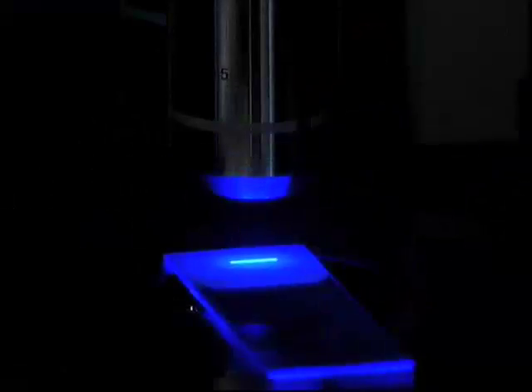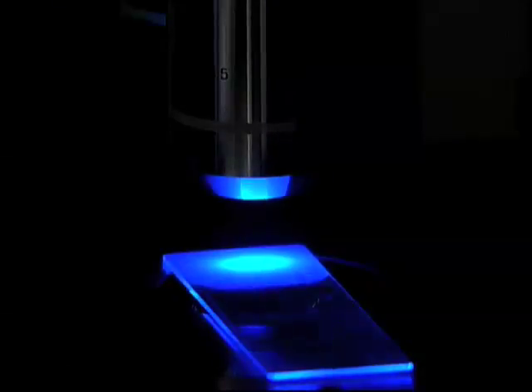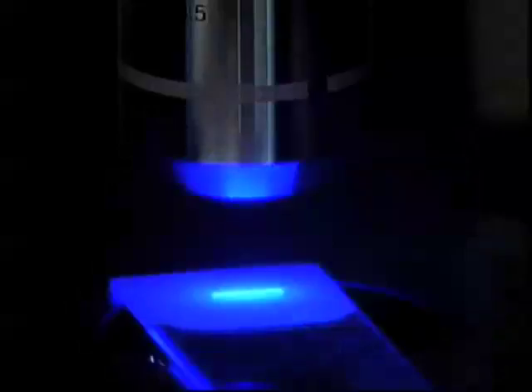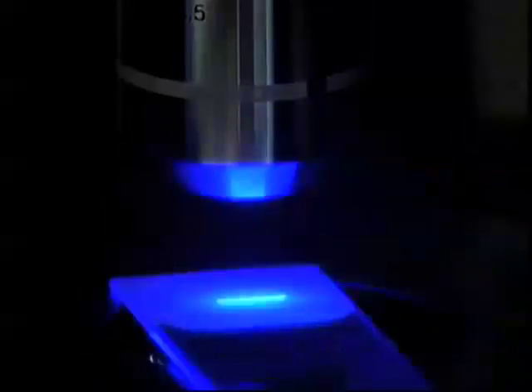So here you can see the laser scanning process in action. You can see the laser sweeping across where the sample would be, and then illuminating each of those pixels in turn. The scan rate in the horizontal direction here is so fast that you just see a continuous line, but you can see the scanning in the vertical direction pretty clearly. So now what we can do is set up how the confocal here scans across the sample.